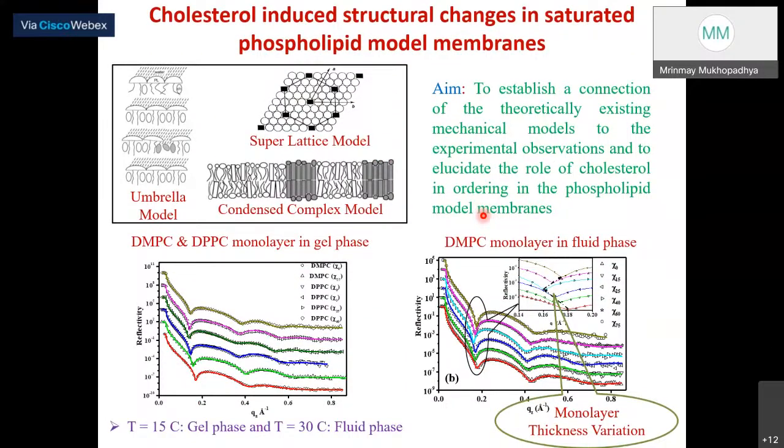This is another study, and I'm running out of time, so I'll quickly go over two more studies, because I started with the polymer-like spectrin chain. Then we have a cylindrical cholesterol molecule and the planar hemine molecule. This is a kind of history of how cholesterols get attached to the membrane and make it stiff.